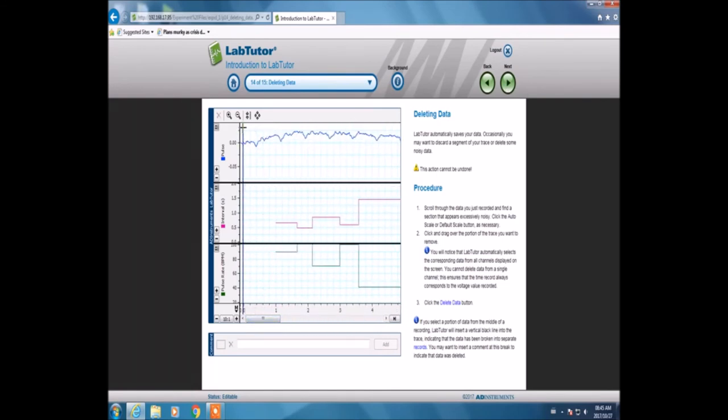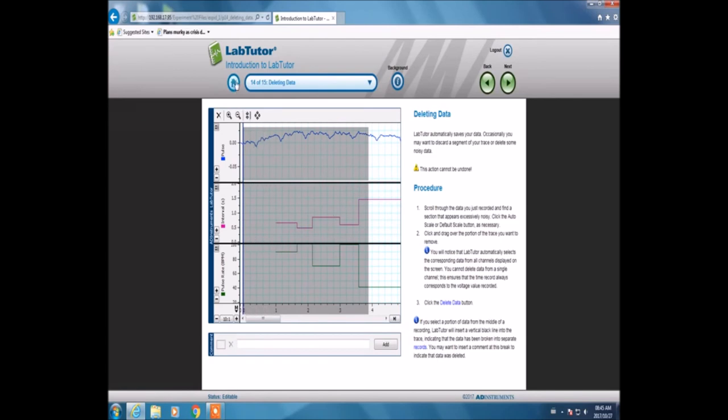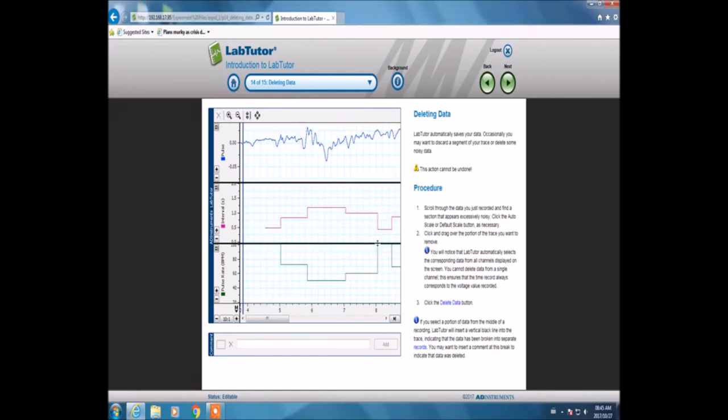This is where we delete data. You need to select the area by highlighting it, then select the deleting part and confirm deletion. It's very important to be able to delete data as you can remove any errors made during the experiment.